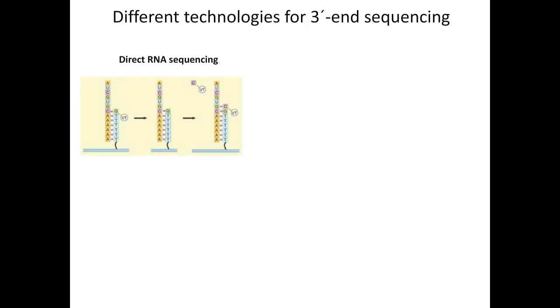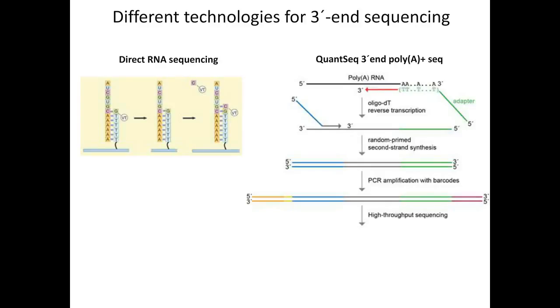And so when we first started this project, there were a couple of options for RNA sequencing of the 3' ends. One of them that was attractive was direct RNA sequencing, which conceptually is very simple. It just involves the single molecule sequencing of RNAs directly from their natural poly-A tails. The other method is the QuantSeq 3' end library prep method, which I just spoke about.